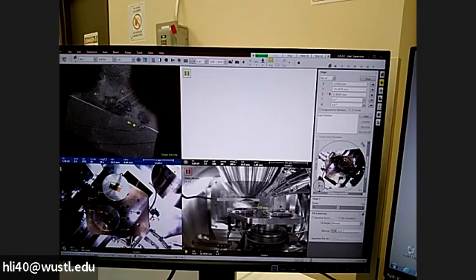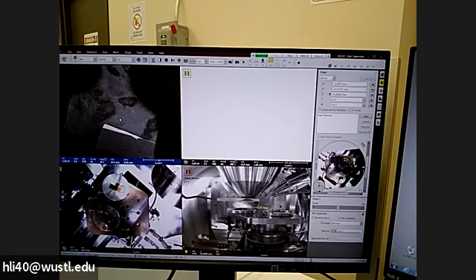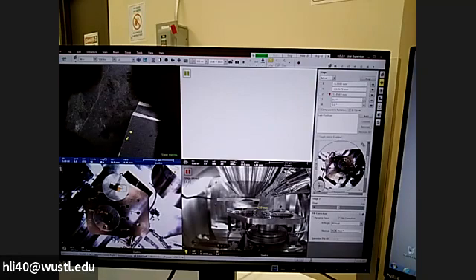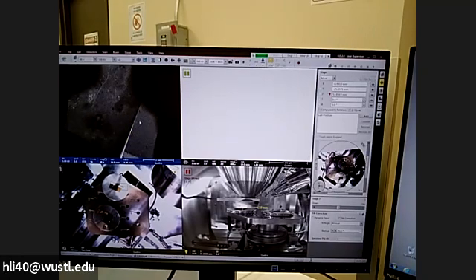So if the arrow is far away from the spot, the circle, then it will drive very fast. So if that's the case, you need to also make your dwell time short so that you can refresh the screen faster. So let's do it again. So we can drive along here, right? So if you want to drive slowly, we drive slowly. We keep it around so we can drive along. So this is another way to drive the sample.